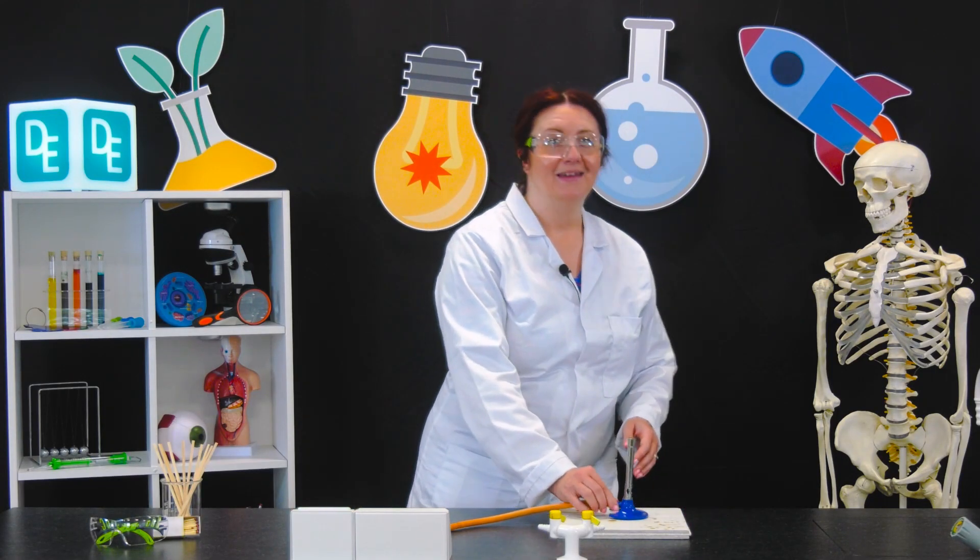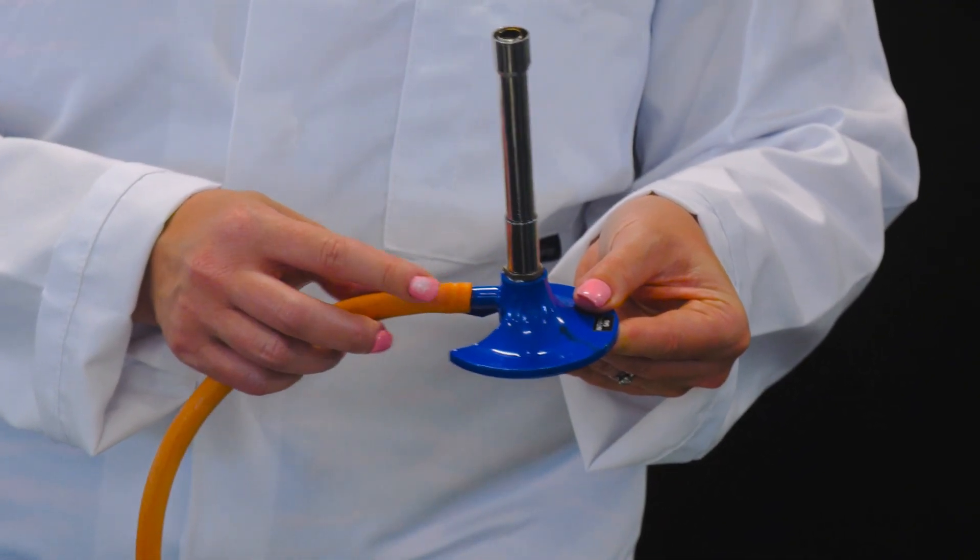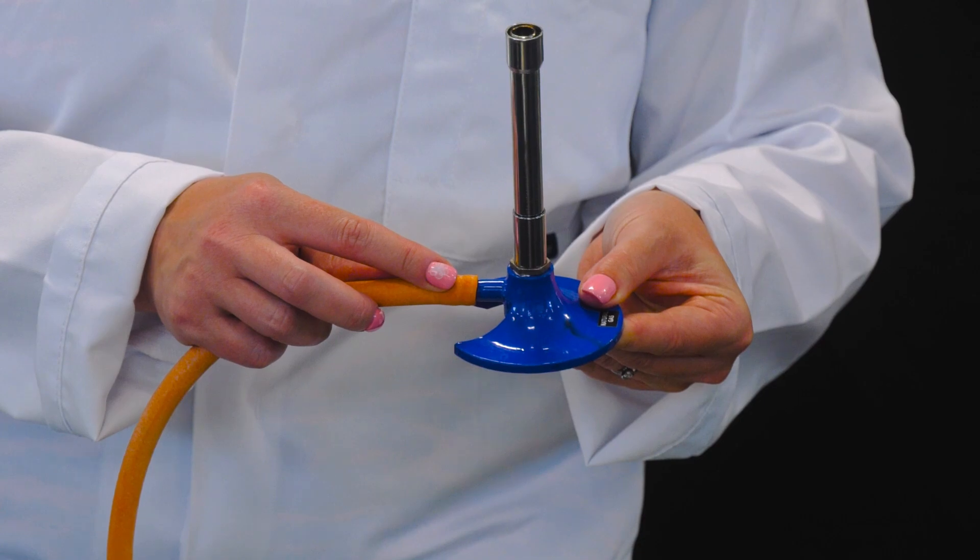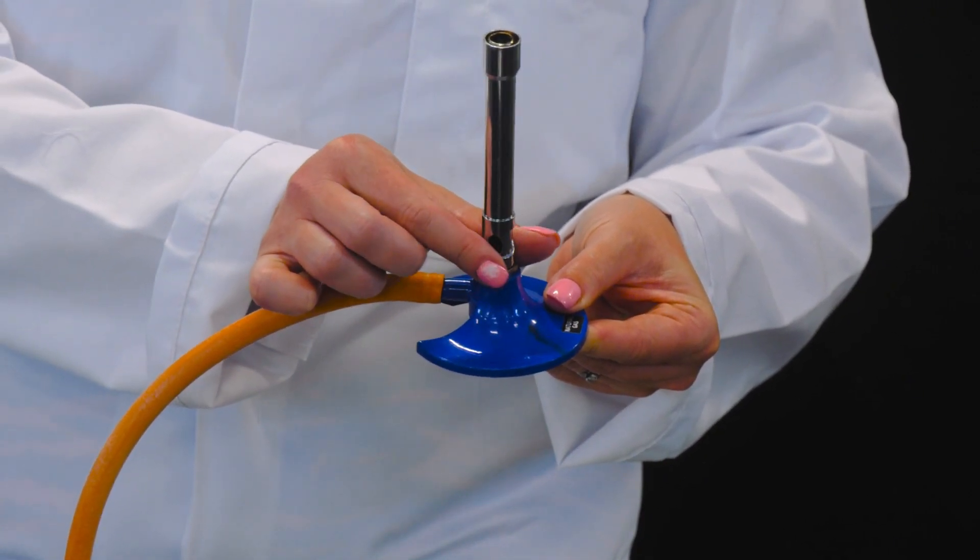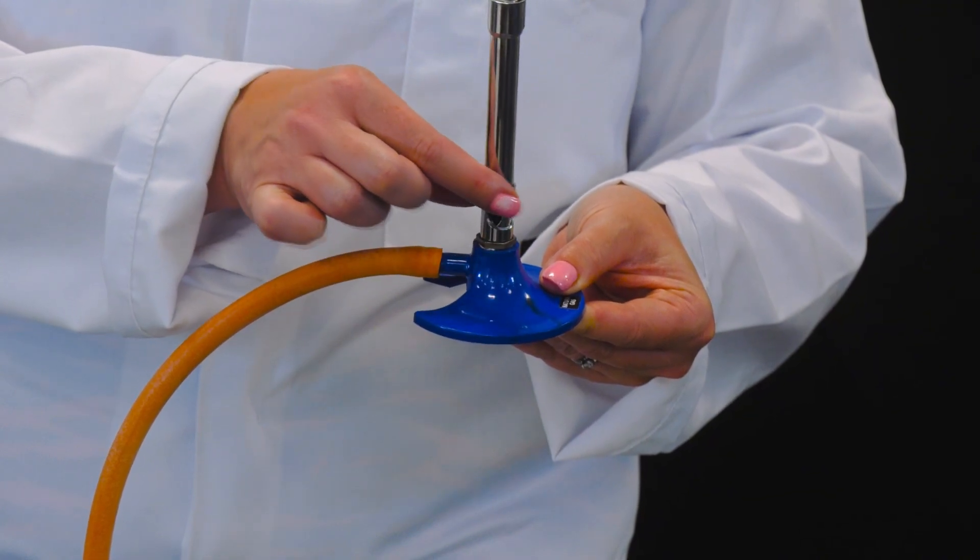Let's get familiar with the parts of the Bunsen burner. Here we have the base, the gas inlet, the air hole, and the collar. The collar controls the airflow, which affects the flame type.